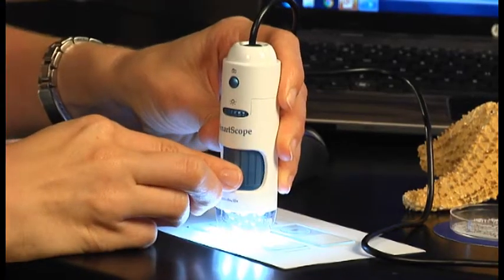And then you can continue to turn the dial to the left. And right there, we have 200x magnification. You can even see the tiny little hairs on the bee wing.